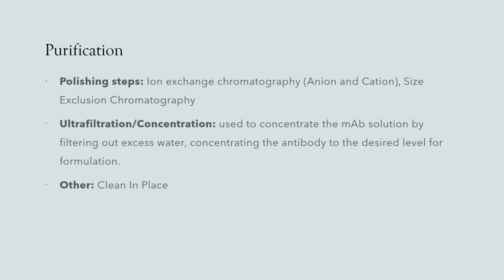further purifying your manufactured material. And then ultrafiltration. Ultrafiltration is a membrane-based separation technique, and it just uses size exclusion principles, if you like, to retain the larger molecules like the monoclonal antibody, and it allows the smaller molecules like water and salt to just pass through it. You can use it to concentrate the antibody solution by removing all the excess water and small solutes.